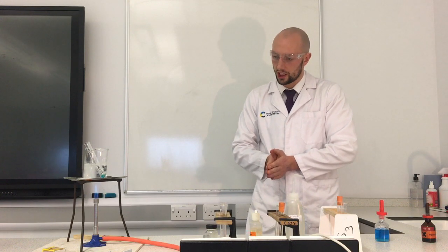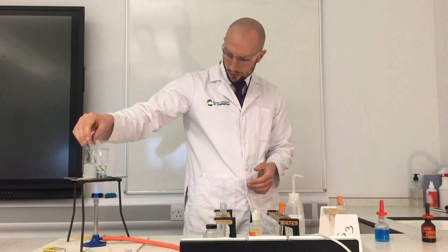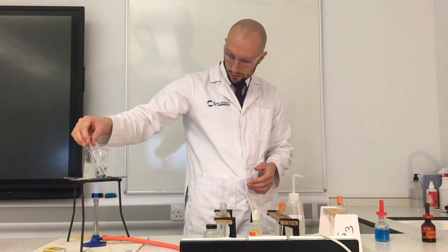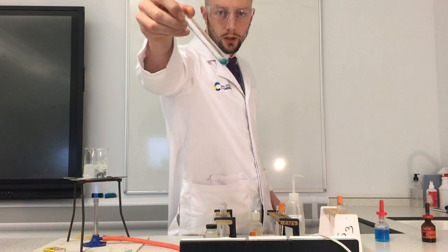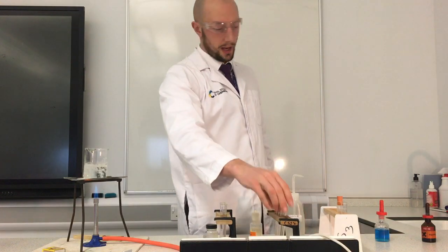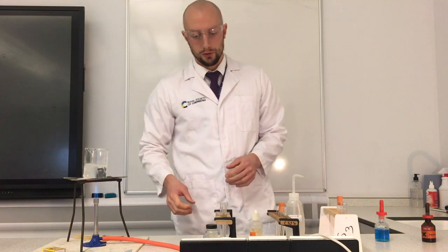The other one was starting to change colour by now, so I don't think it's going to change. That's getting very, very hot in there, but it's not changing colour. There we go. It's still blue. So that tells me that there is no glucose in my rice cake. So we saw that there's starch in a rice cake, but no fat and no glucose.